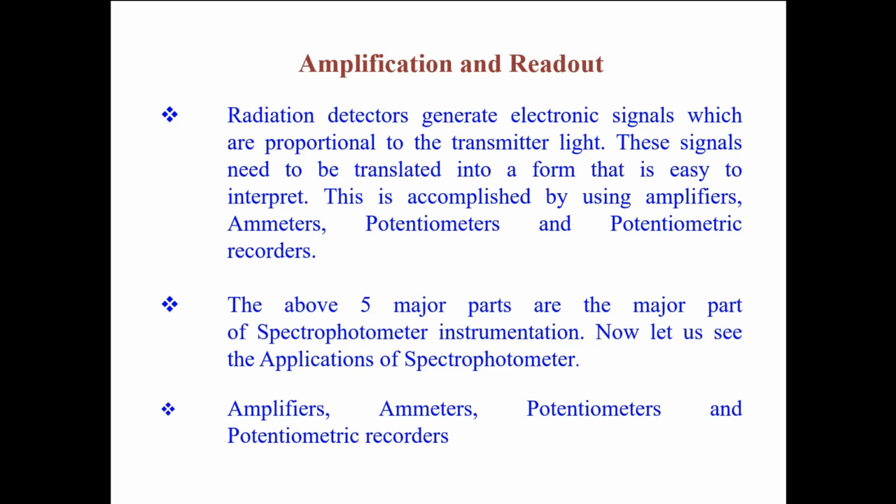But when we talk about UV visible spectrophotometry, we need only one kind of sample holder. So that's why we use quartz or silica quartz cuvettes, which will not absorb either visible light or UV light. So that's why we use them combinedly for all the samples, whether the characterization is at the visible region or at the UV region. So we will place the sample in the cuvettes. Okay, the cuvette is a quartz cuvette, where there is no interference.